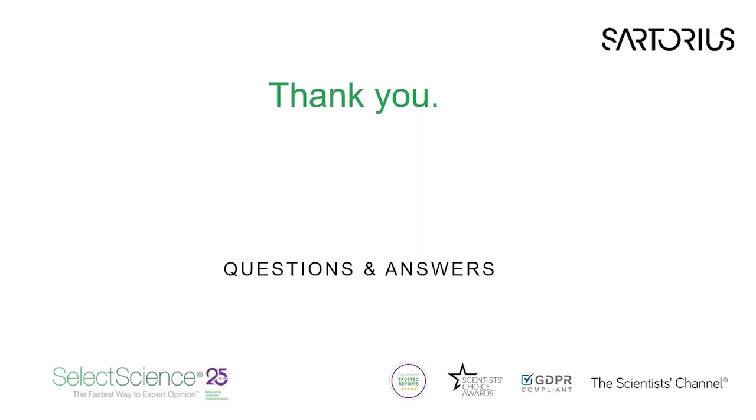Great, thanks a lot. And how can I improve my accuracy when working with dilution series? So, as we said, pipettes are precision instrument tools and obviously require training to use them accurately and precisely. You need to make sure that you follow your best pipetting practices and consider the liquid properties to increase your accuracy and precision. Obviously, electronic pipettes remove those dependent variables and can be used to further improve the repeatability. For dilution series specifically, you should ensure that all solutions are properly mixed. And if you want any further training, then please talk to your Sartorius representative and they can help you with perhaps a pipette academy.